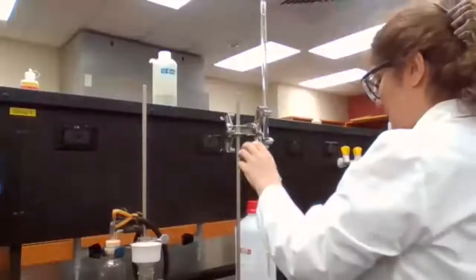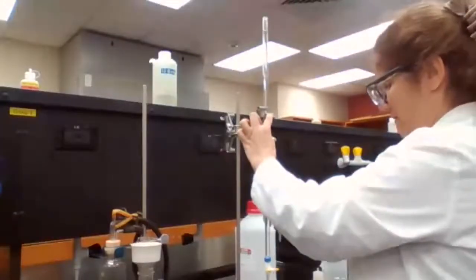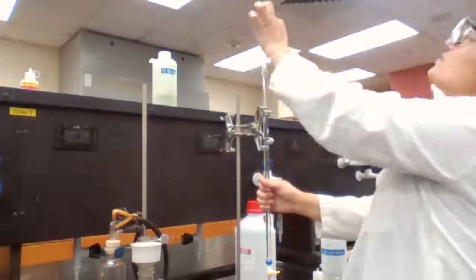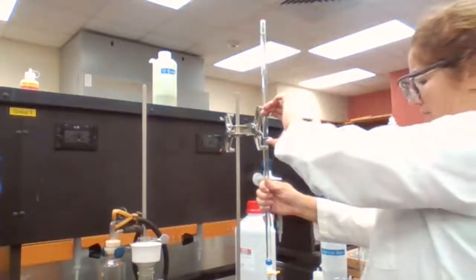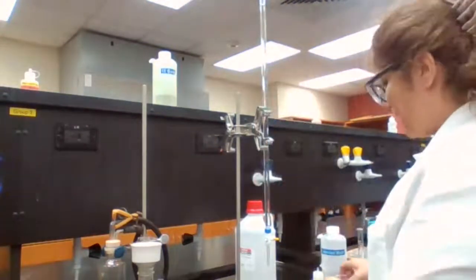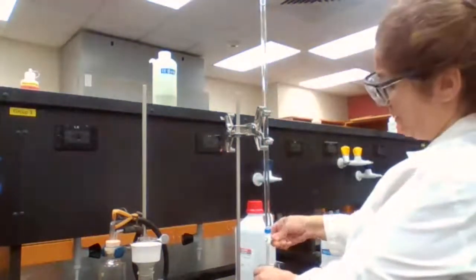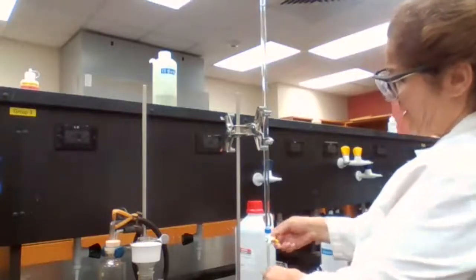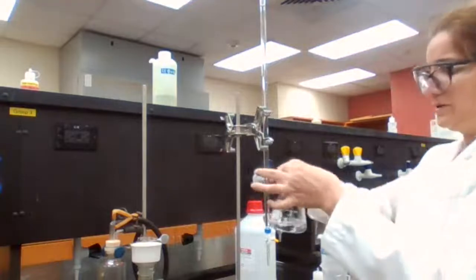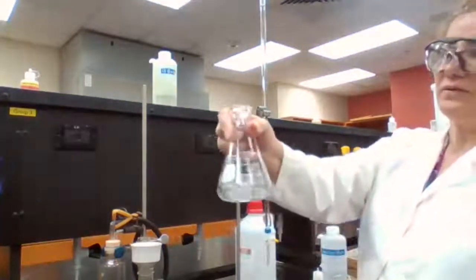Okay. You can bring this down to see if the meniscus is at 0. When it's set at exactly 0, I can start my titration. The acid has dissolved.